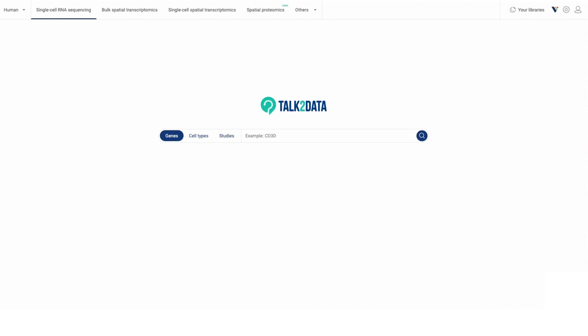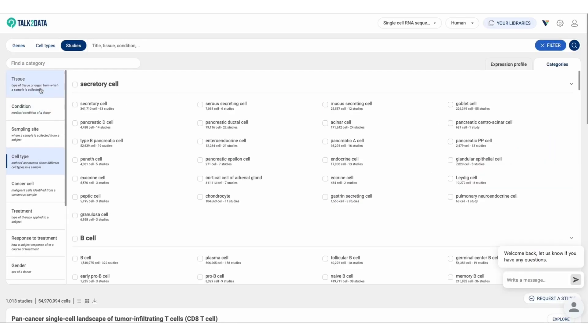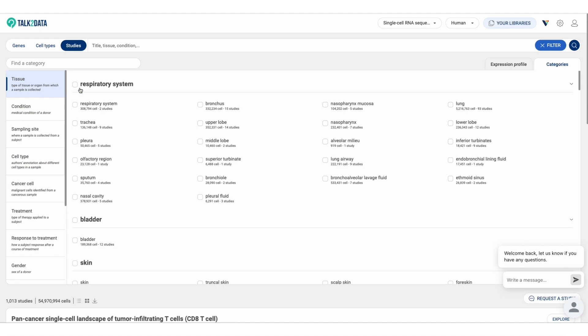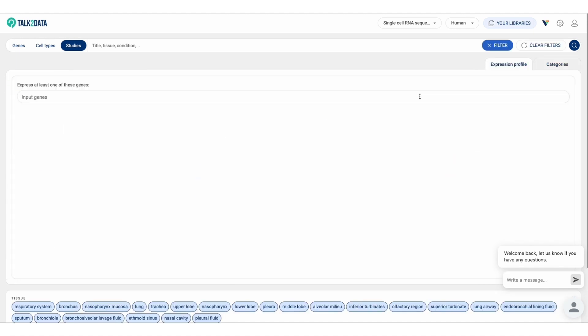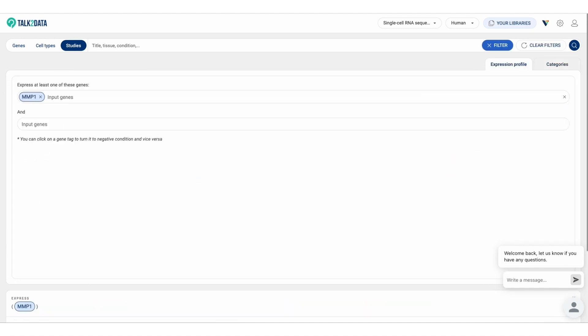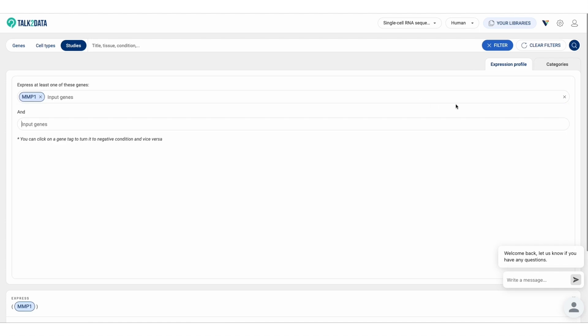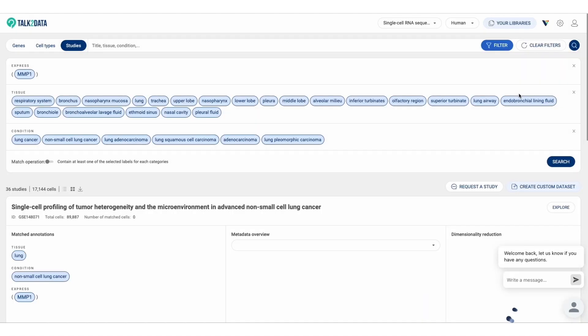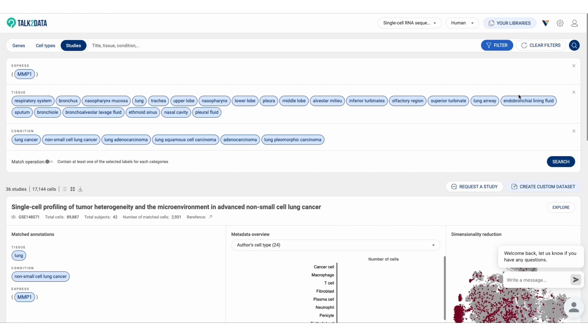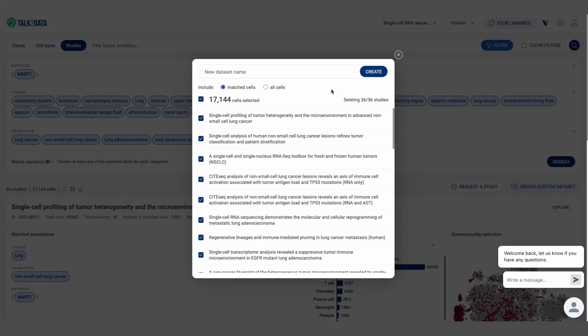With Bioturing's Talk2Data, we offer a way to quickly search for public datasets and to specifically choose a subgroup of cells that fit your study with just a few clicks, filtering data by condition, tissue, and gene expression. From 36 studies, we pull out this in silico atlas of 171,144 lung cancer cells that express MMP1, a gene that plays important roles in both tumorigenesis and metastasis.